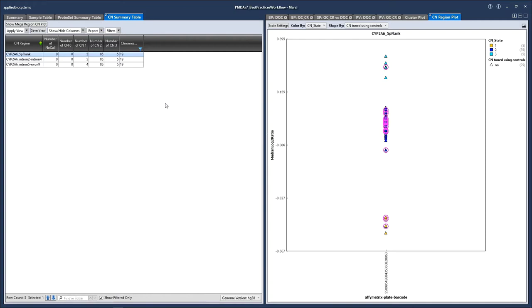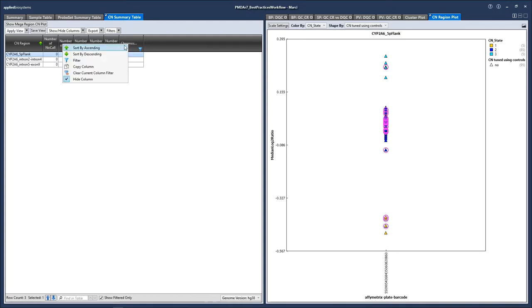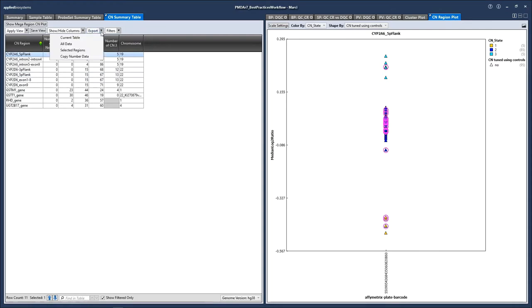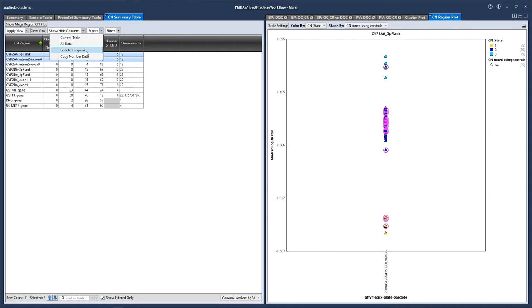You have a few different options for exporting. First, export current table would export a text file of just what is shown in the table currently, reflecting any filters that have been applied. We can also choose export all data, which would export the full table without any filtering. We can export selected regions — so if we had one or two rows selected, we could export those. We can also choose export copy number data, which would provide a text file with the full copy number information for each sample and each fixed region.